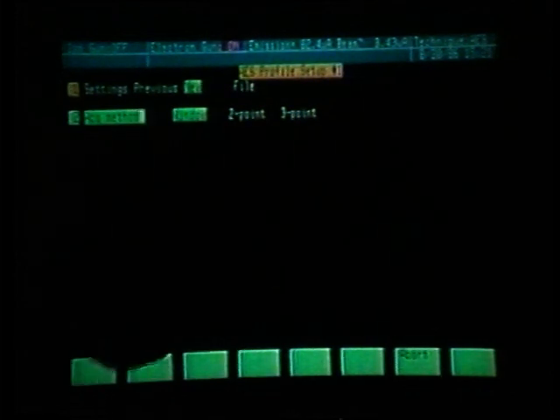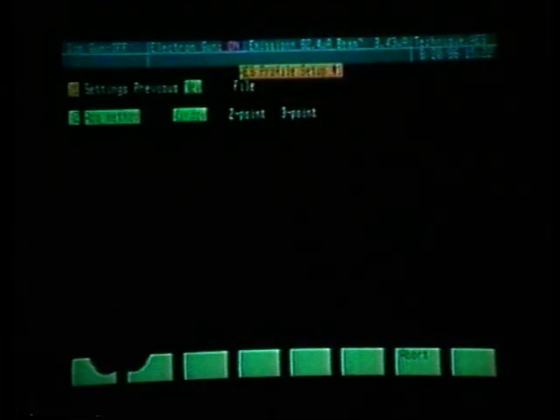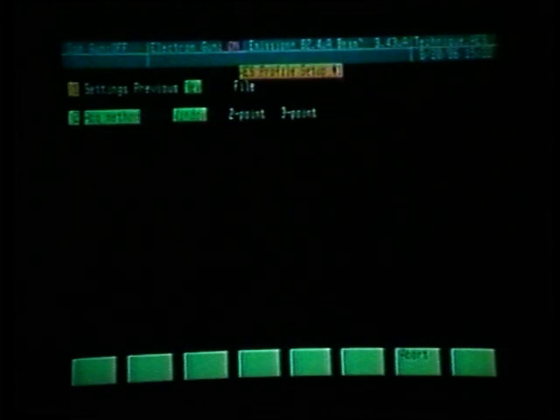Also, a disadvantage to the 2-point and 3-point is we do not have sensitivity factors for the N of E spectra. Therefore, we cannot generate atomic concentration information from a 2-point or a 3-point profile, but we can from the window profile. With these things in mind, let's set up a window profile first, and when we are finished, we will set up for a 2-point profile.